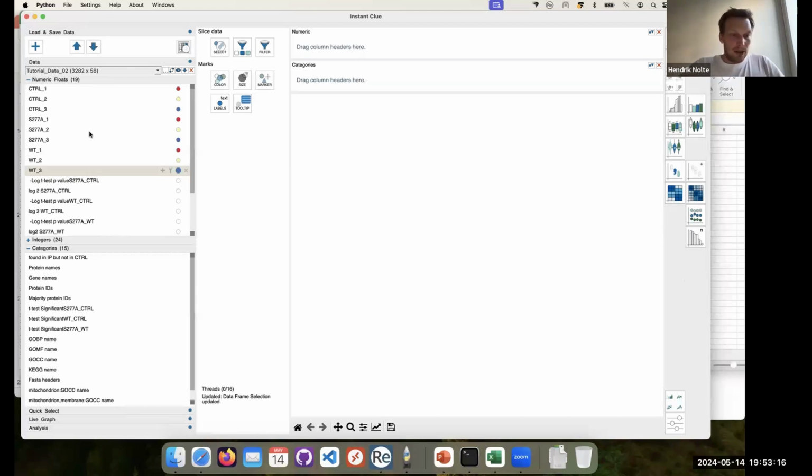Maybe you can read up on the theory behind it, since we are running out of time. On the GitHub pages, I have added a link, I think from Google, where you can play around with the UMAP and get a really nice feeling for the parameters that you can set, because there are a lot of parameters and they affect the outcome a lot.